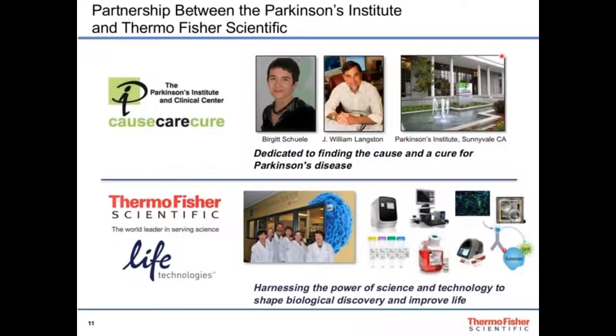Before we get into too much detail about CRISPR-Cas, I want to give an example of a project we did to engineer a disease model in human iPS cells. We started this project in late 2012, before CRISPR-Cas was really proven to work in mammalian cells, so we did this project with TAL effectors.